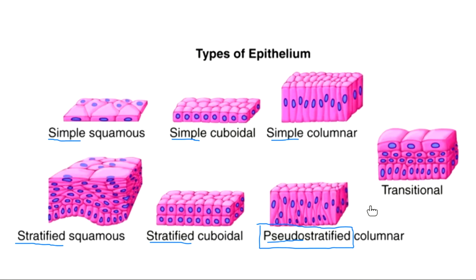One last type of epithelial tissue whose name does tell us about its shape, but it makes us kind of sad on the inside, is called transitional epithelium. Transitional epithelium means that its shape changes, or it transitions. So this type of epithelium is going to have lots of different shapes of the cells. There's going to be multiple layers, but the big way we'll identify it is that it changes shape. So transitional epithelium changes shape. Simple epithelium, one layer. Stratified epithelium, more than one layer. And my fake it till you make it, pseudo-stratified epithelium.